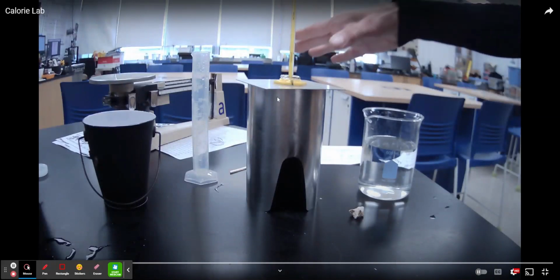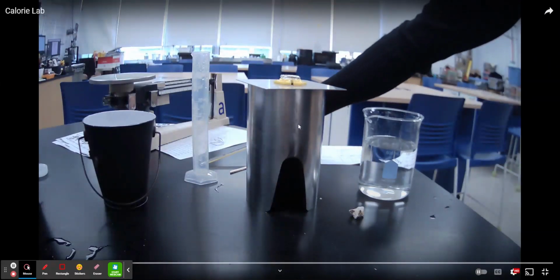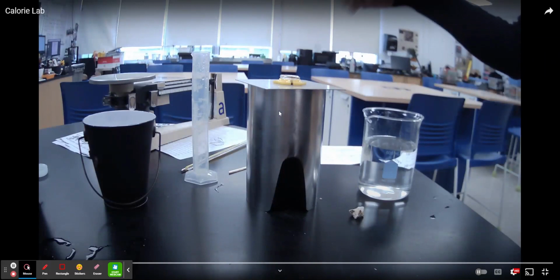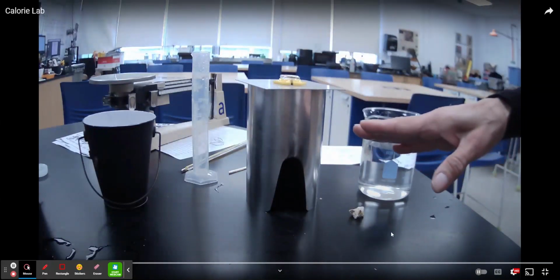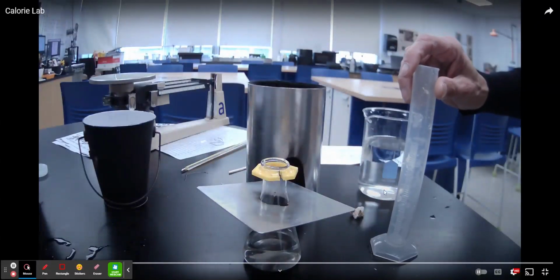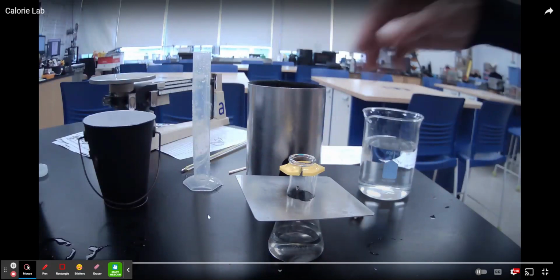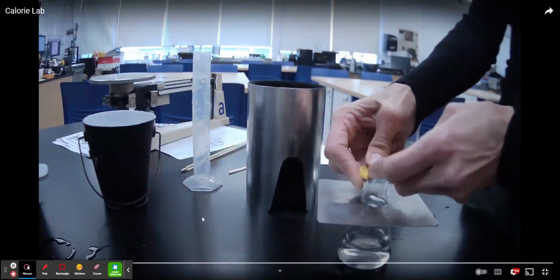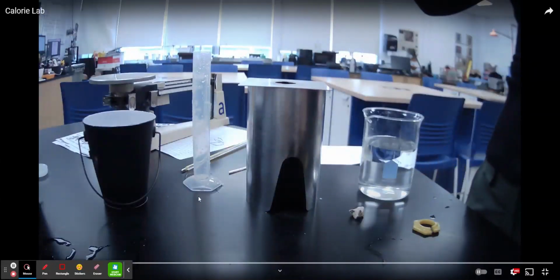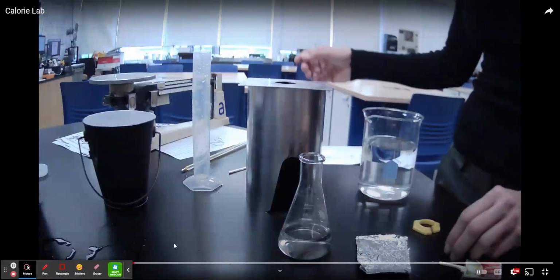So what we're going to be using is a calorimeter. This is the combustion chamber. You'll have a thermometer in degrees Celsius. You'll have an Erlenmeyer flask. You'll see that in a second. A 50 milliliter graduated cylinder, distilled water, a food sample, a wood splint. That's the Erlenmeyer. You'll have a collar, some aluminum foil, etc. You'll also have a data sheet to enter the data that you find. The collar just pops off and on, and that metal top is just used to suspend the Erlenmeyer flask over the burning food. So there's the matches.